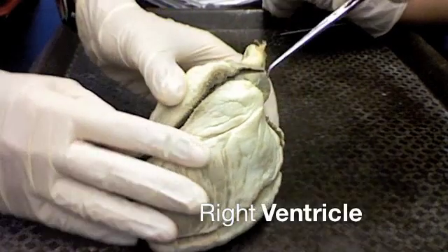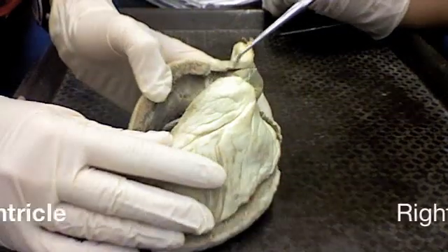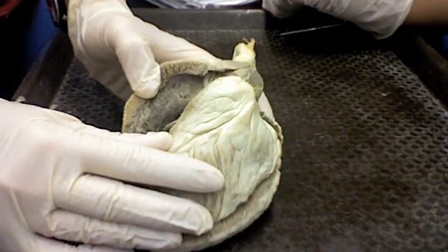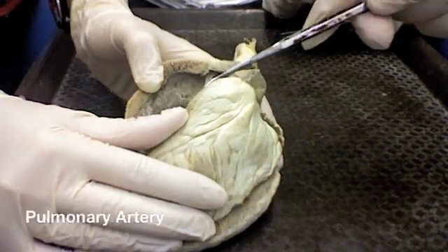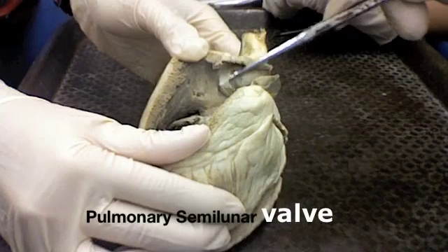So this would be the right ventricle. What I did was I went from the pulmonary artery and cut open the front of the right ventricle here. This would be the pulmonary artery here, and one of these would be a semilunar valve flap — a little pocket.